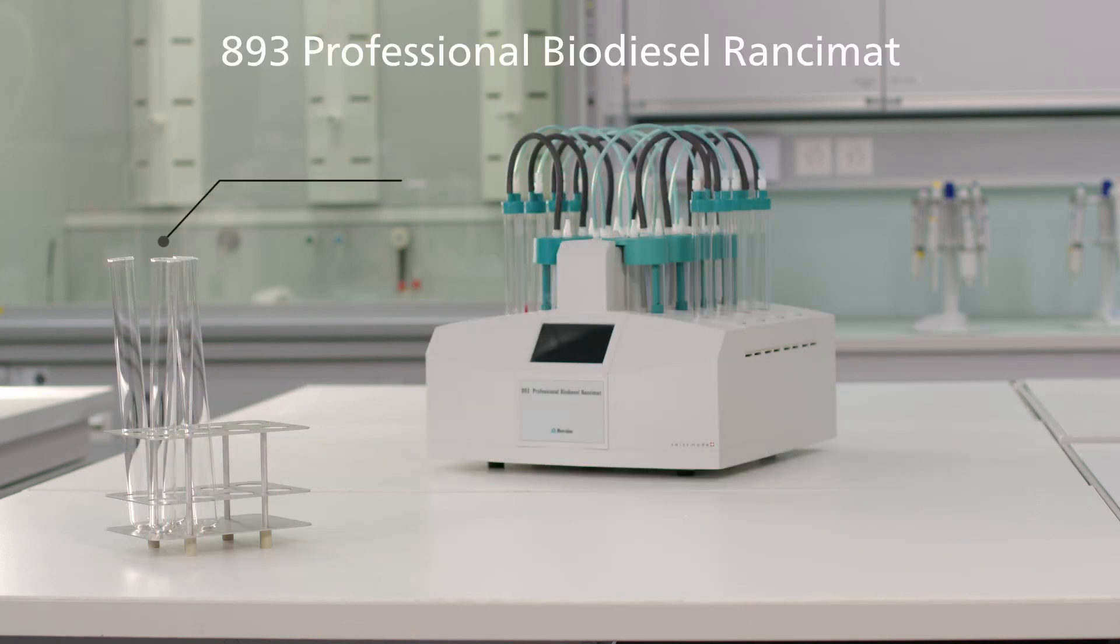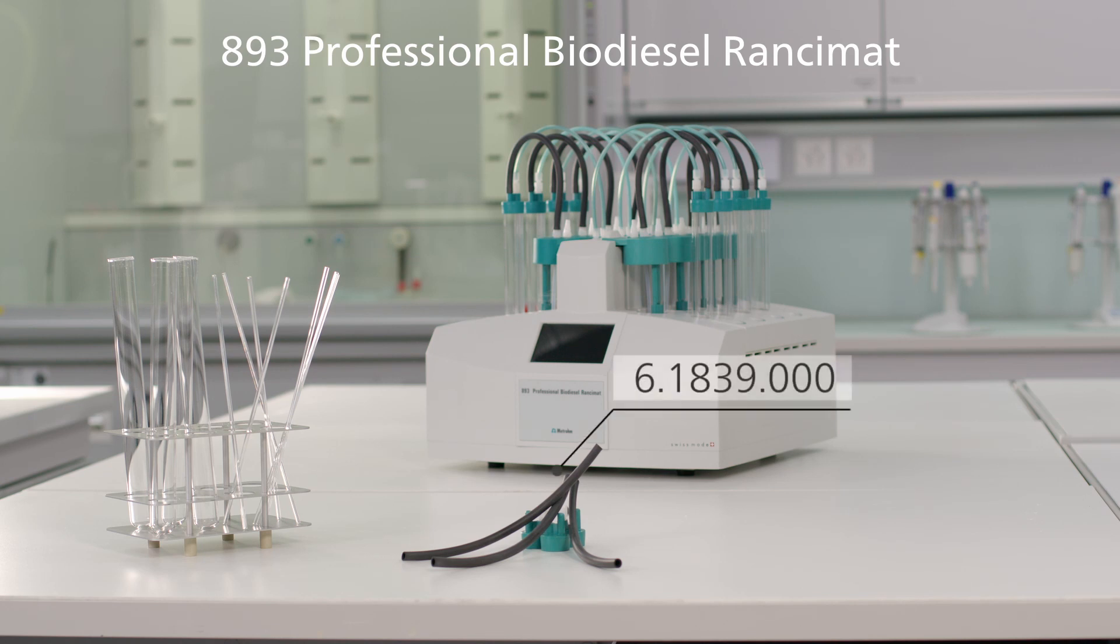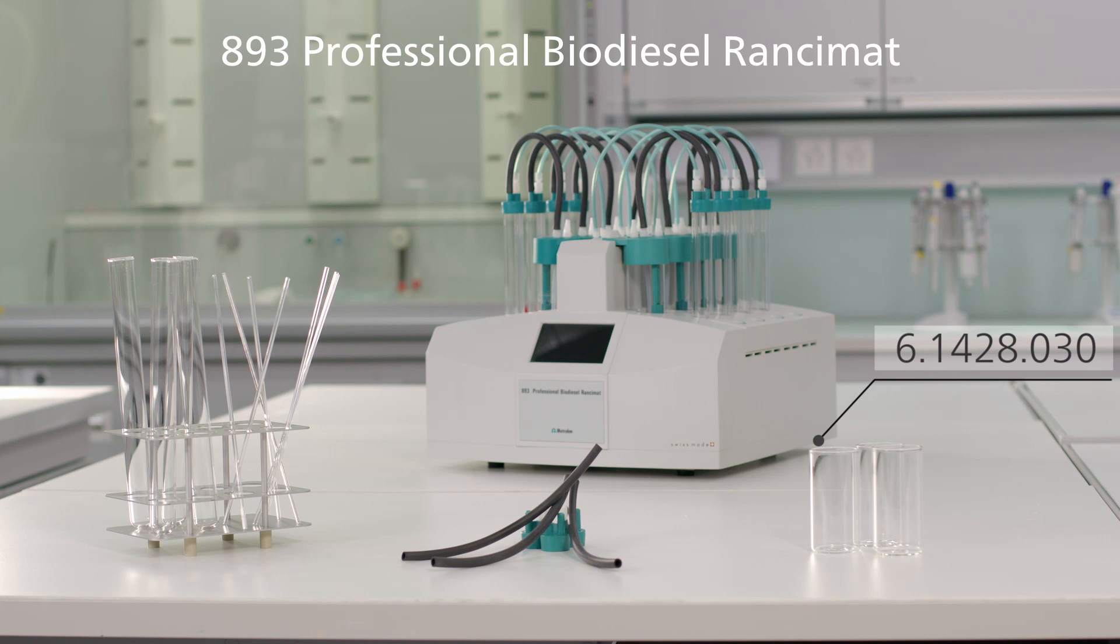Use the long reaction vessel, the air tube for biodiesel measurements, the isovacinic tubing and glass beakers for the oxidation stability measurement of biodiesel or biodiesel blends.